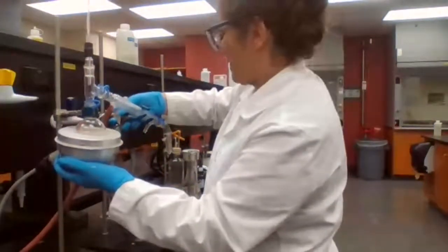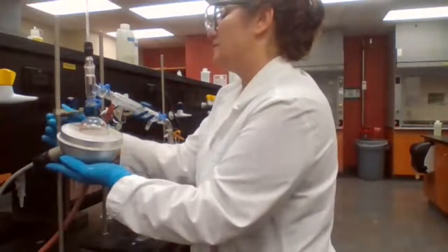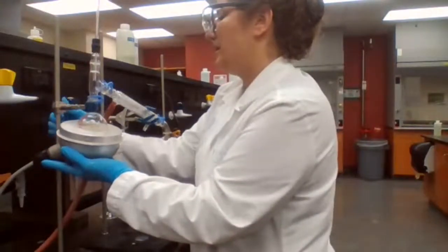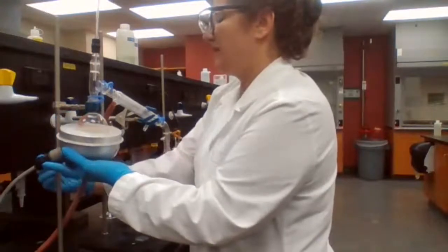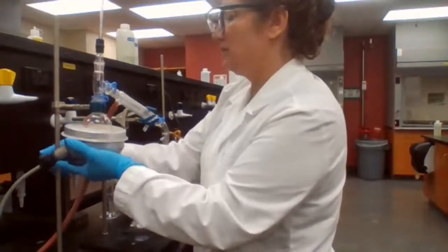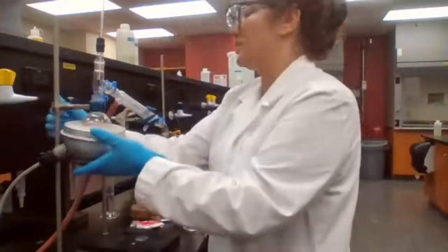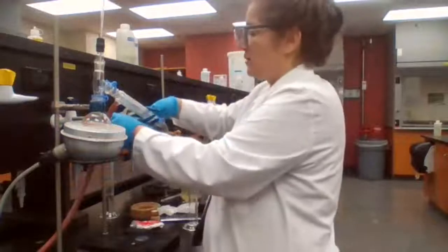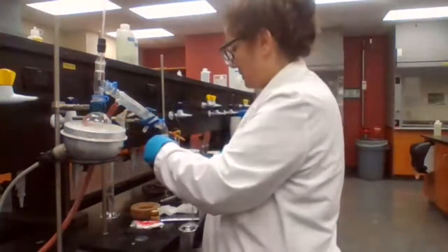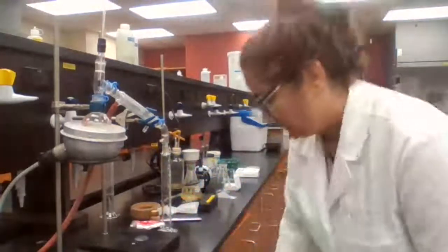But when I'm working by myself, I should be able to manage this by making all the clamps loose, holding on to the pieces of glass and lifting it up at the same time, and then going back and making it tight. So now it can fit underneath.